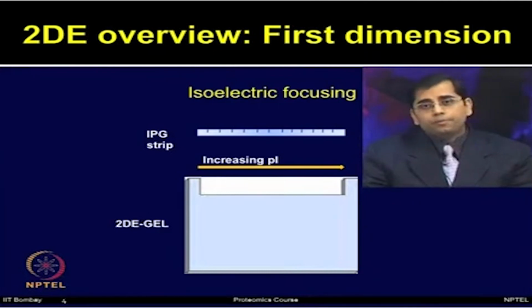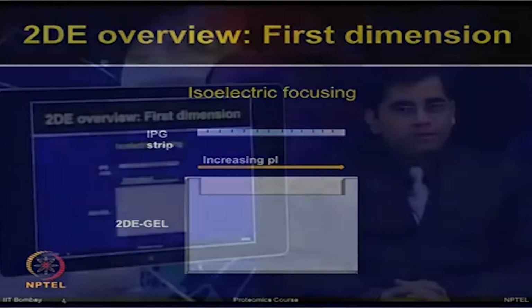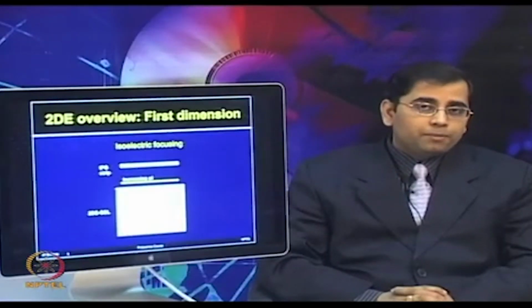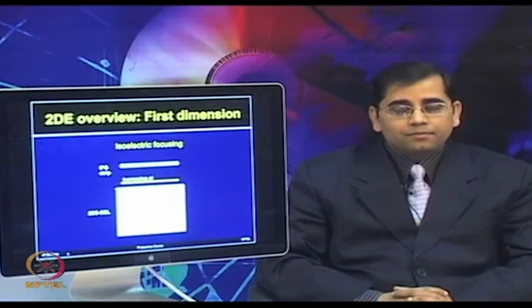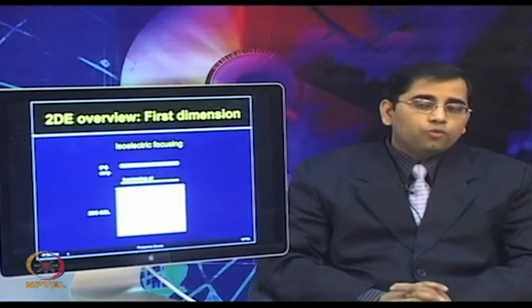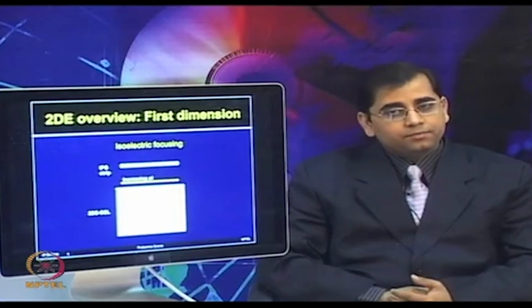Ideally, you want to separate as many proteins as possible, which means you want very high coverage of the whole proteome. Considering the diversity of samples which one can apply to these techniques, it becomes very important to first standardize a very good protein extraction.